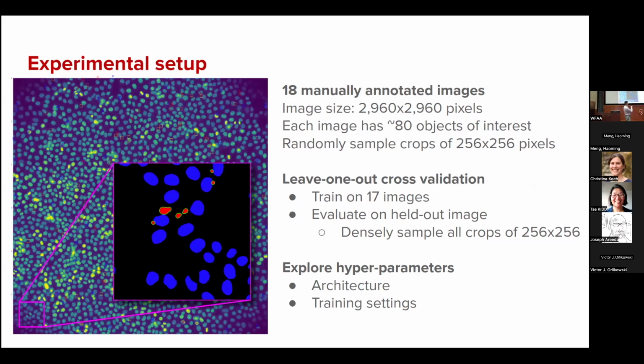And for each of the large images, we're not going to run all of the analysis on the full image. We're going to do it in a tiling type of pattern. So there is a lot of repetition here. And of course, exploring hyperparameters is also something that takes time. We need to calibrate certain parameters in the machine learning algorithm. We also need to calibrate certain parameters in the architecture and so on. So there are a lot of experiments required in order to do this.